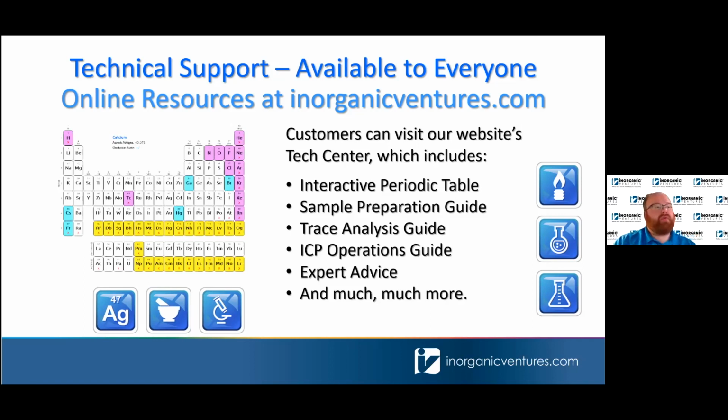I am not sure about an appropriate range. I have run it before without any issues. One thing I will say, there is a white paper by Agilent out there somewhere. It's very hard to find, and it took me a long time to re-find it. They actually have a rinse solution they proposed for mercury, and it's just dubbed as Agilent cleaning solution. It has nitric, it has HCl, it has EDTA, it has peroxide, it has ammonium hydroxide. It's basically got the kitchen sink in it. But like I said, it does have peroxide, and that solution works pretty well.